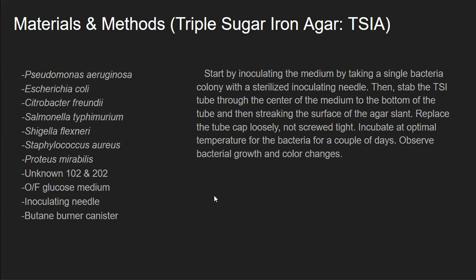Replace the tube cap loosely, not screwed tight. Incubate at optimal temperature for the bacteria for a couple of days. Observe bacterial growth and color changes.